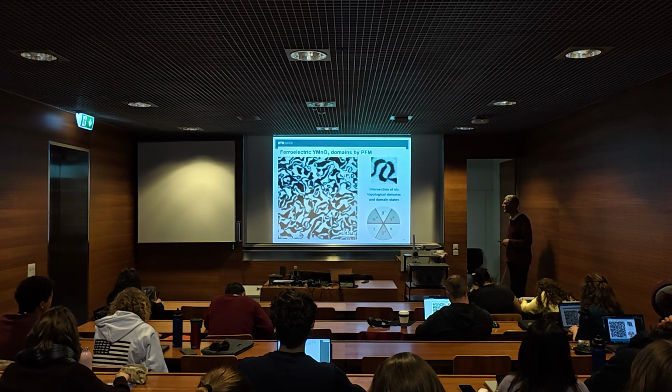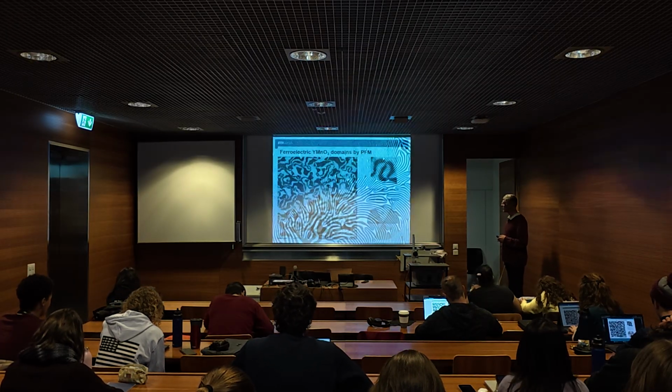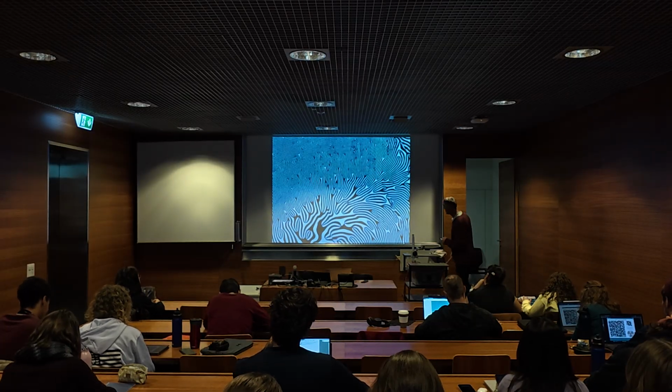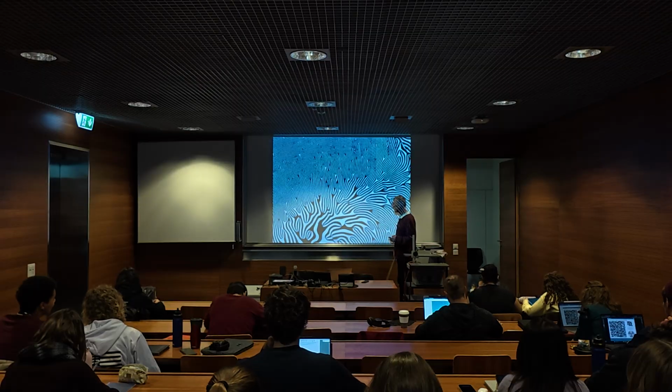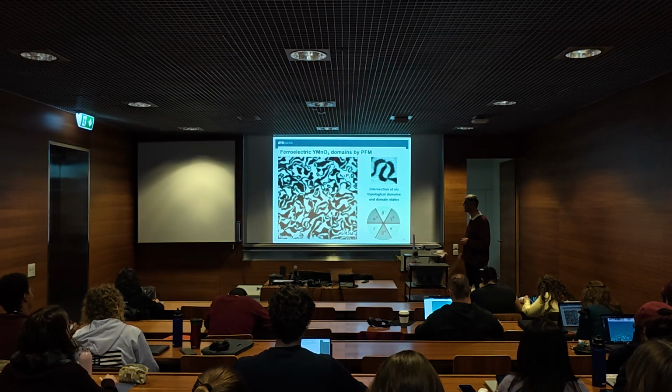So stuff like that happens, and then can produce very beautiful patterns actually. So this is one that we measured on a sample. Same idea, right? So 6 meeting in one point, always. In principle, this is a bad sample, meaning it's not as homogeneous as this one.